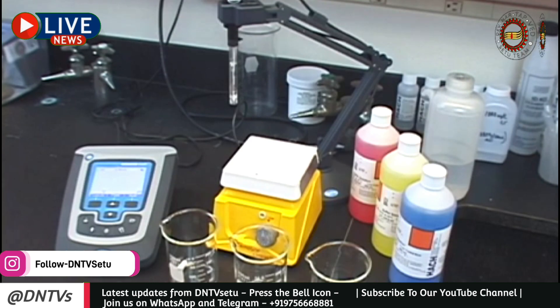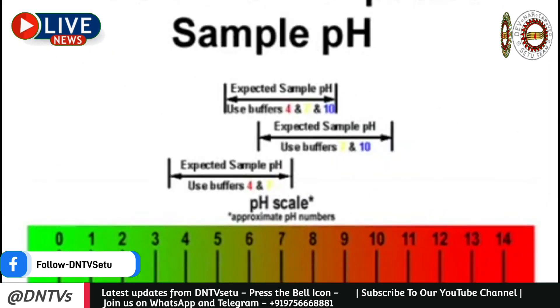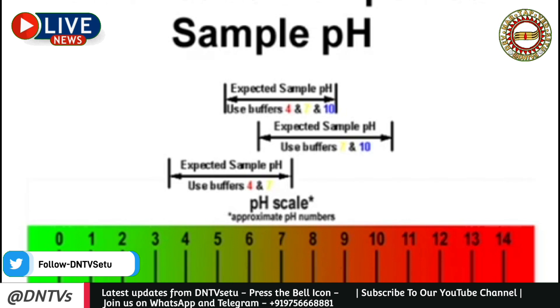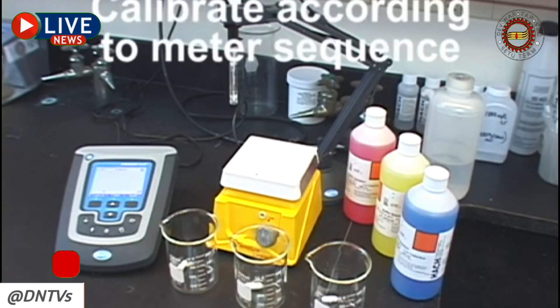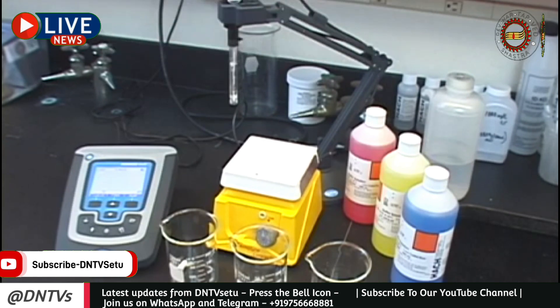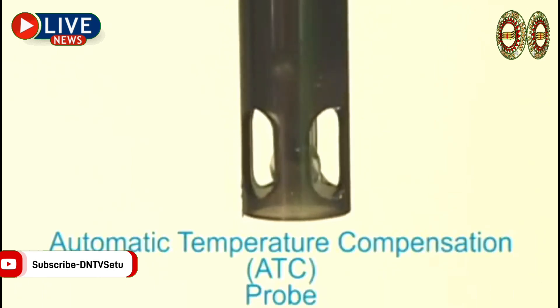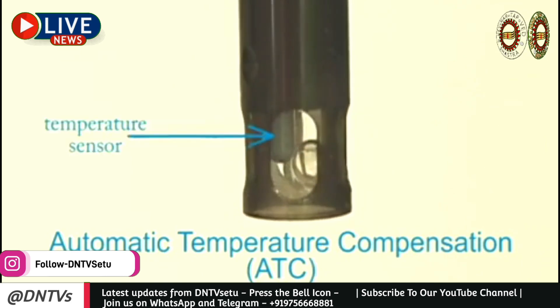Now let's discuss the importance of using the correct buffer values for your calibration. Ideally, you'll want your calibration points to bracket your expected sample pH. For example, if your expected sample pH is 8, calibrating with the 7 and 10 buffer is sufficient. If you expect measurements to fall between 6 and 8, consider a three-point calibration using the 4, 7, and 10 buffers. Always calibrate in the sequence specified in your meter's user manual; if no sequence is stated, calibrate from the lowest pH to the highest. Remember, pH is temperature dependent — a simple way to address this is by using automatic temperature compensating, or ATC, probes, which ensure an accurate reading at any temperature.